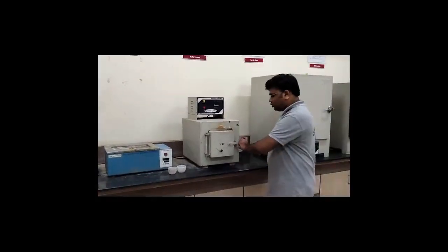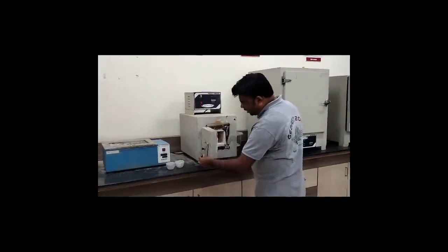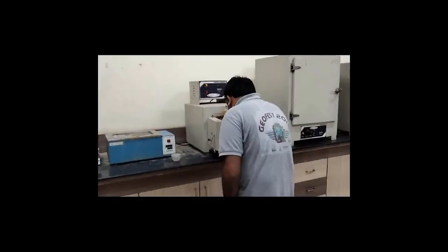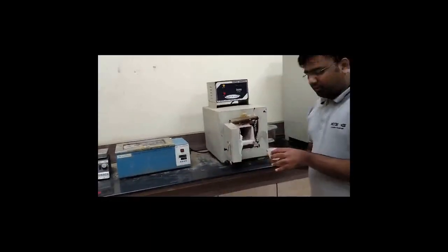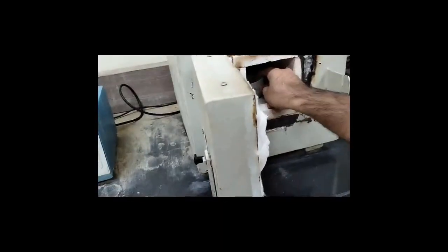So we are going to keep crucible number B first, inside, and then we are going to keep crucible number A. Okay, you can see we have kept both the crucibles A and B. So these are the crucibles A and B that we have kept.